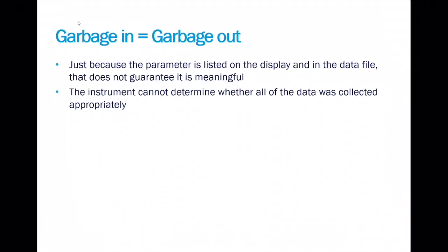So again, just to reiterate, because you have a parameter that's in your data file, it does not mean that it's meaningful. So you're the researcher, you know the experiment you're doing, and you have to make sure you set up the instrument to collect the parameters that you're really interested in.